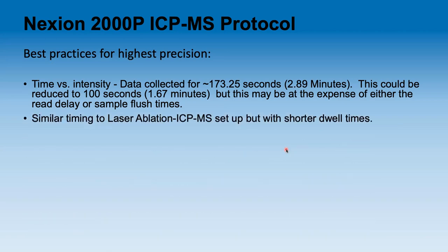So the other thing is that you want to set up the timing similar to a laser ablation ICP-MS. I don't know if any of you guys have ever used that, but it's basically time intensity data. But we want those dwell times to be really short. We want to capture each and every data point, and we want to work with those. The software can be funky. So I prefer to take this data, capture every single data point with these quick dwell times.